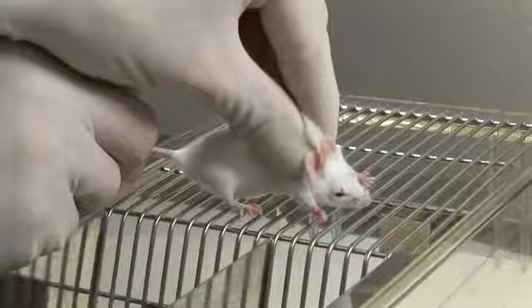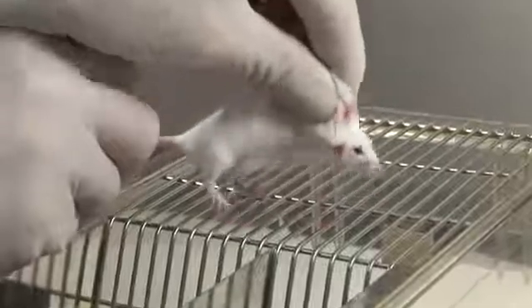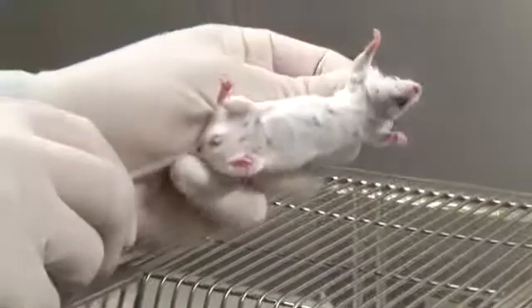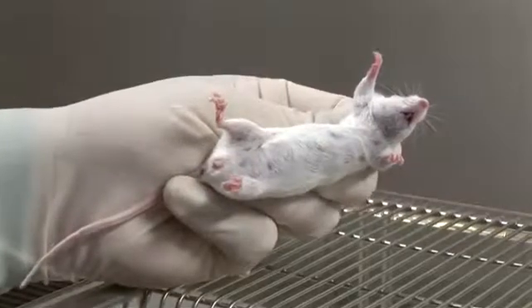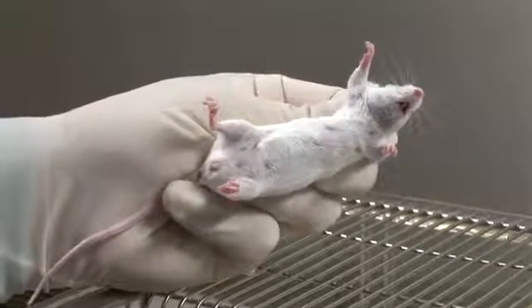Then, while maintaining a grip on the scruff and the base of the tail, lift the mouse and turn it over so that its body is supported across the palm of your hand. Transfer the grip on its tail to your third and fourth fingers and palm.